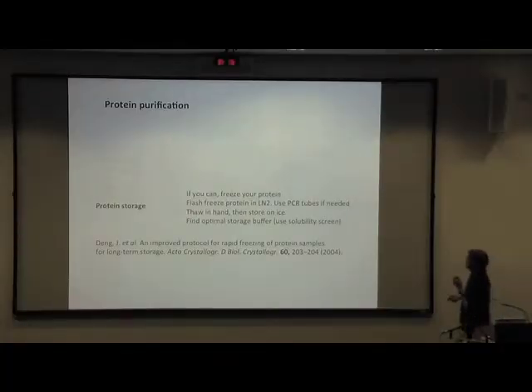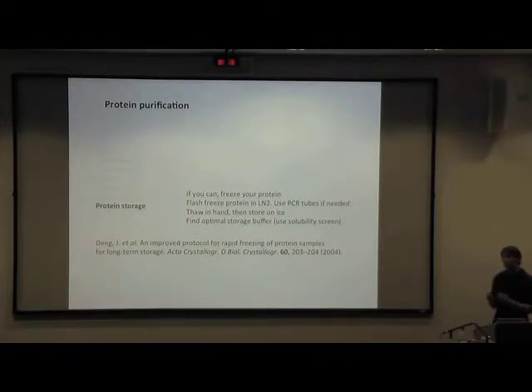And then storage. I think if you can freeze your protein, you should always do it, because you take a very important parameter out, or a variable out of your protein, and that's time. You stop time. So when you're able to freeze it, you can go away and pick it out of the freezer and it will be the same as it was a week ago, or maybe 2 months ago.